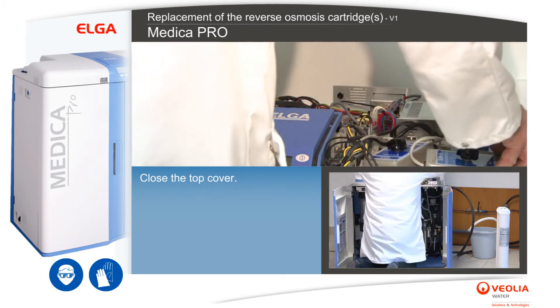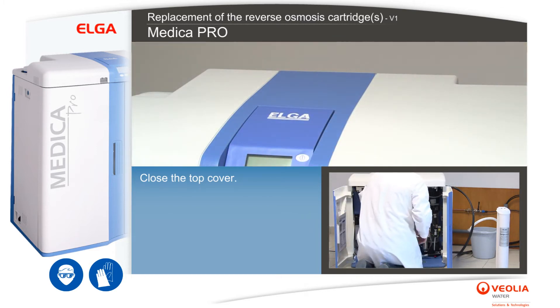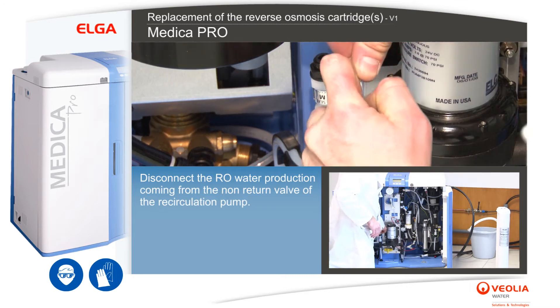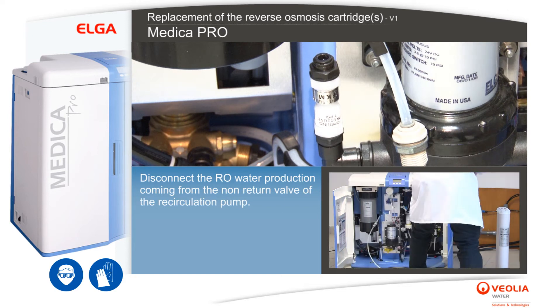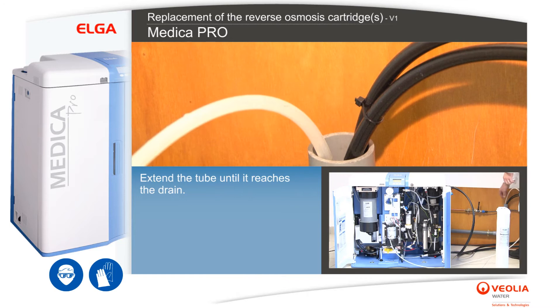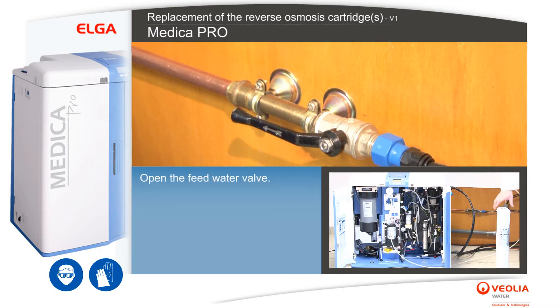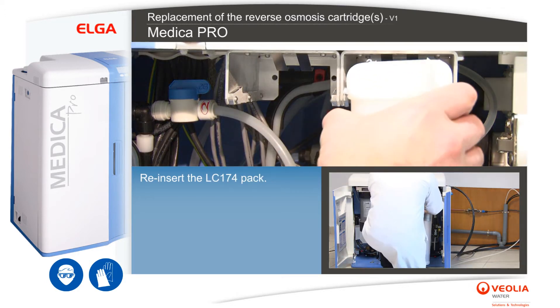Close the top cover. Disconnect the RO water production coming from the non-return valve of the recirculation pump. Extend the tube until it reaches the drain. Open the feed water valve.